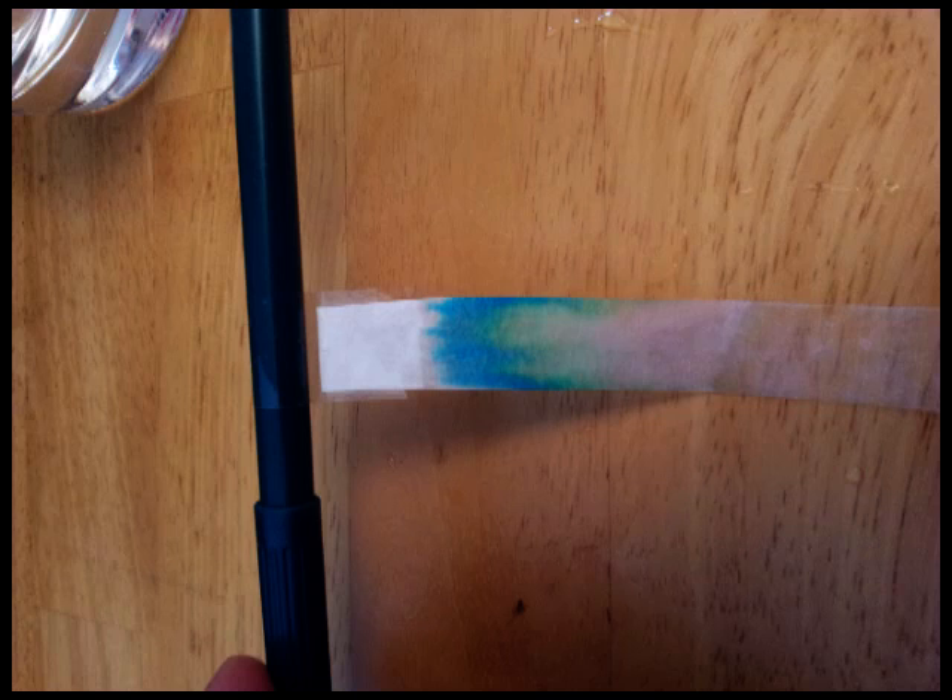Capillary action isn't really too important for this. But as water moves up the strip, the ink in the line that they've drawn will dissolve into the water and it'll be drawn up with the water, so it'll start to travel up the strip.